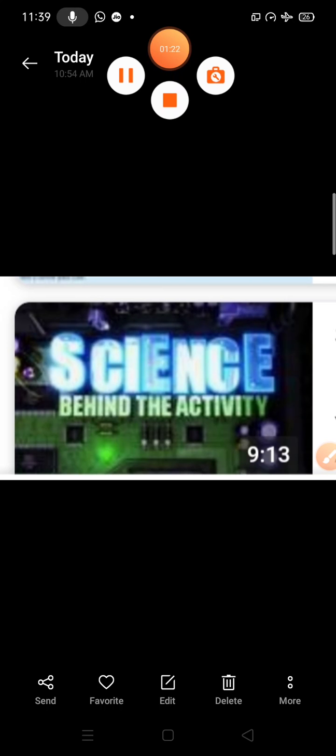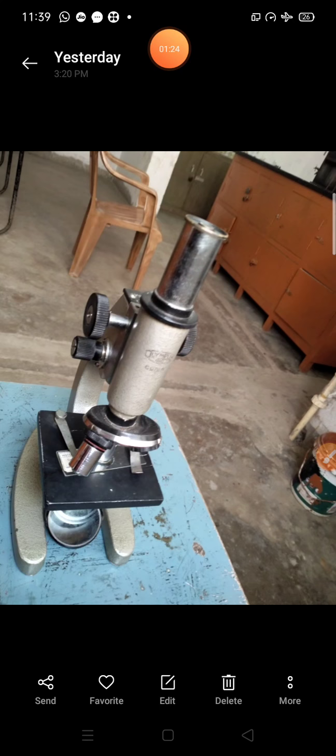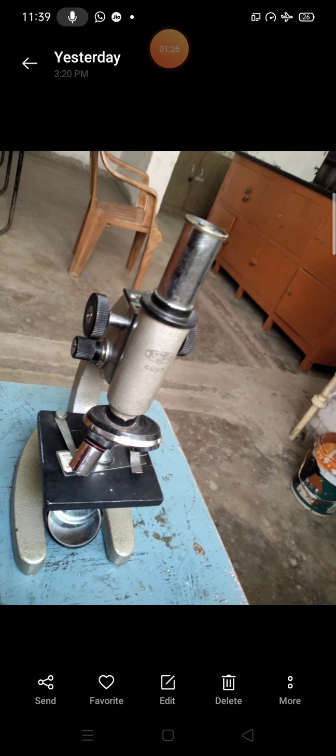The lab activity topic is the study of striated muscles under the microscope. For performing this activity, first of all, we require a compound microscope.